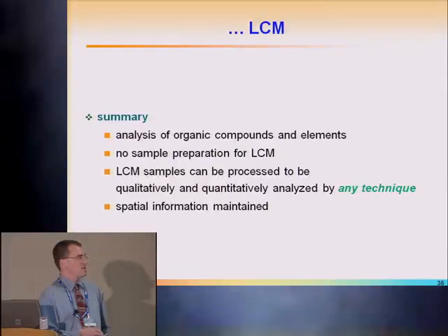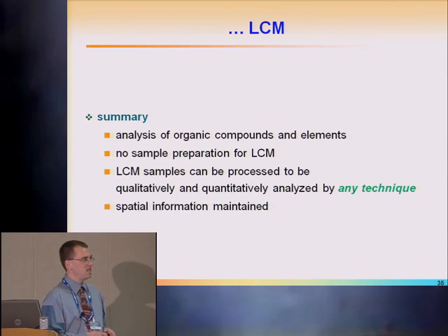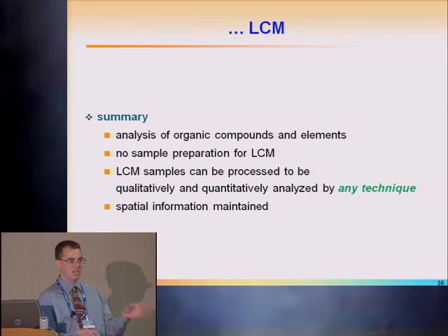So in summary, laser capture microdissection can be used for the analysis of organic compounds and elements, and there is no sample preparation for laser capture microdissection. And the nice thing again is that the laser capture microdissection samples can be processed to be analyzed qualitatively and quantitatively by any technique. So these samples could also have been submitted to LA-ICPMS, and the spatial information is maintained. So for us, laser capture microdissection is considered an imaging technique.